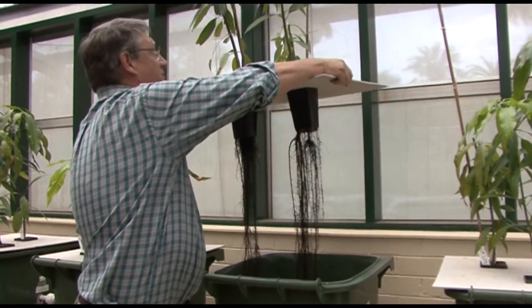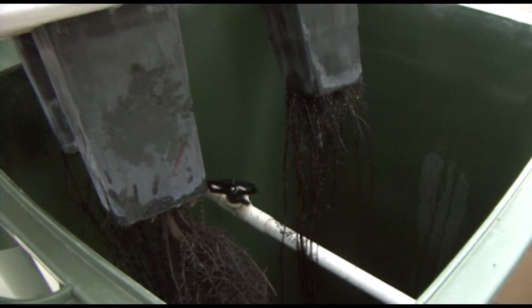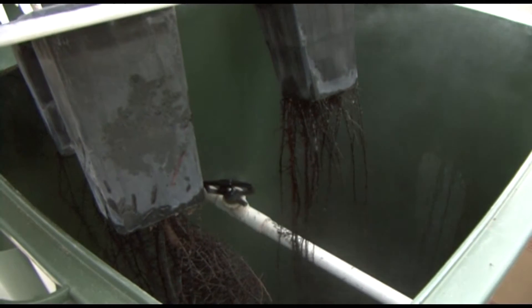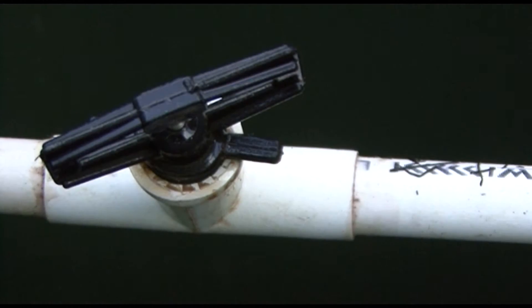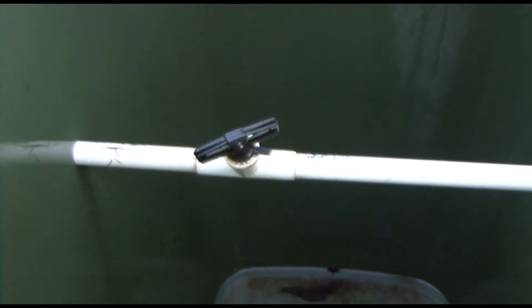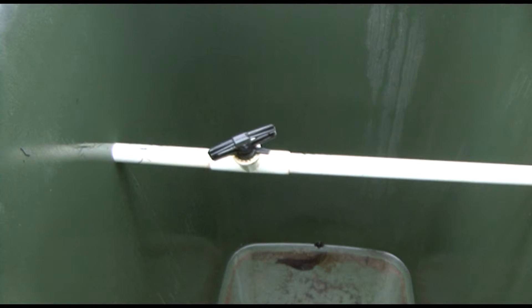We've got the pots growing and suspended in these bins. These are the roots growing out of the plants. They're growing above the solution, which is misted through a conventional garden sprinkler every two to three minutes during the day, less frequently during the night. The fertilizer in the solution is just a conventional hydroponic solution which runs to waste, meaning we have no problems with pH changes over the course of the experiment. It's a conventional two-part mixture which we make up weekly and is topped up on an as-needed basis.